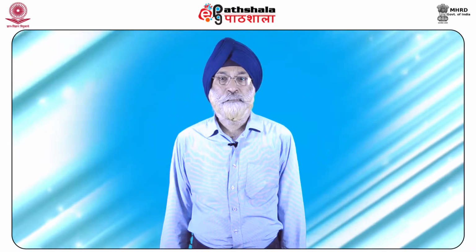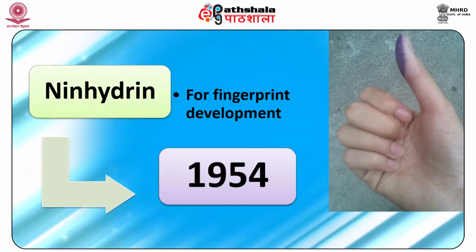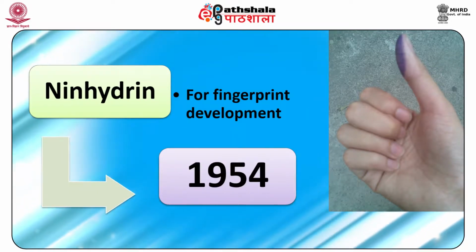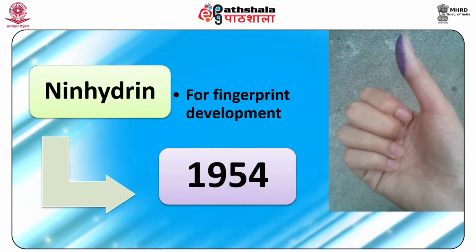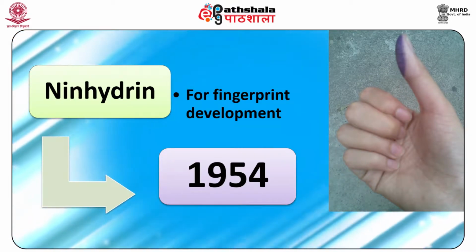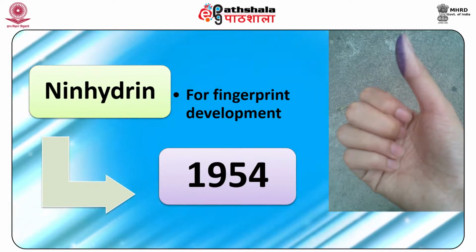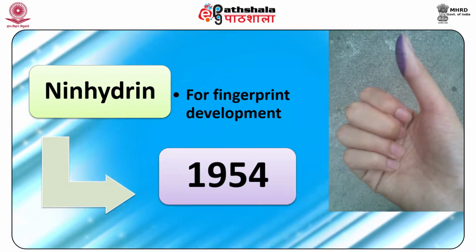Now we take up Ninhydrin as a fingerprint reagent. Ninhydrin was first used as a fingerprint reagent in 1954 when two Swedish scientists, Odén and Hofsten, developed latent fingerprints on paper, cardboard and similar materials with the aid of Ninhydrin. A year later, Odén patented this procedure.